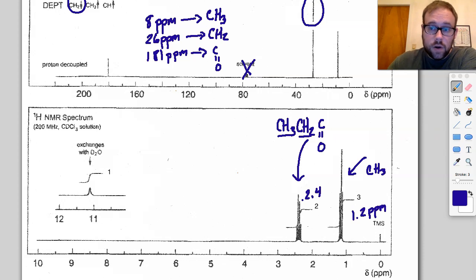Can we confirm the carboxylic acid? We can. If we come over here we see that we have something that exchanges with D2O around 11 ppm, slightly over about 11.1 ppm. Anytime you see something that says exchanges with D2O, it means it has protons that are readily removable, so you're talking about carboxylic acids, alcohols, amines, things of that nature. This at 11 to 12 ppm, that is where a carboxylic acid proton will always show up. That's the only thing that usually shows up in that region. So this confirms with an integration of one and a signal that is this far downfield, this is absolutely a carboxylic acid.